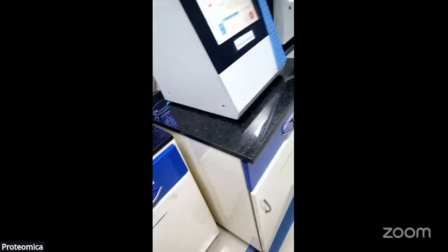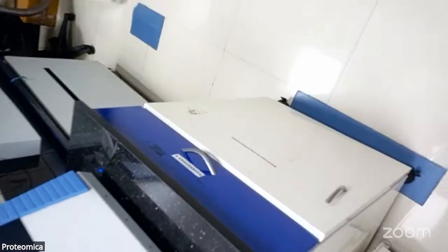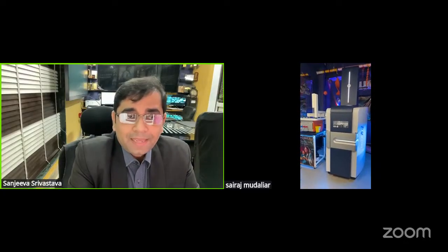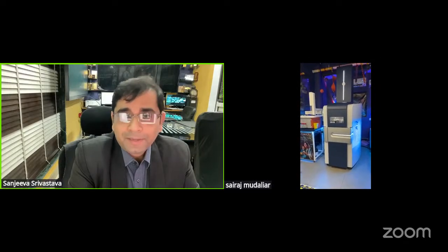All right. So what you saw is mass spectrometry, and while it looks like one instrument or one technology, there are different types of specialized mass specs which can do different types of applications. You just saw three types of mass specs for looking at the global proteome analysis, looking at the global metabolome or lipidome analysis, and targeted proteomic analysis. Now, even global proteomics can be done on different instrument platforms. One we showed you was the Orbitrap technology.